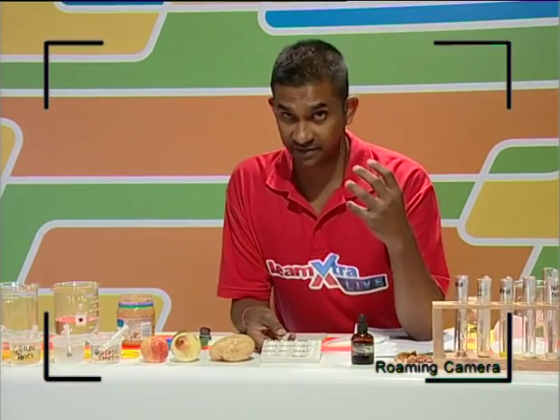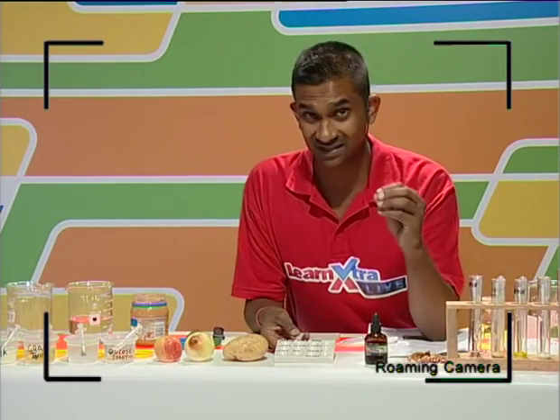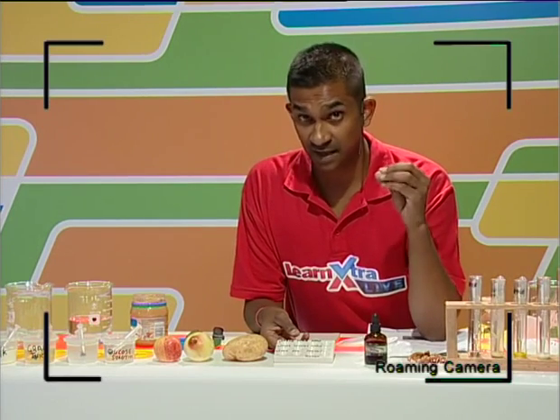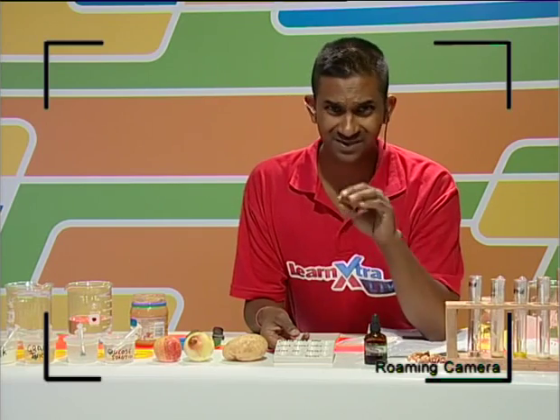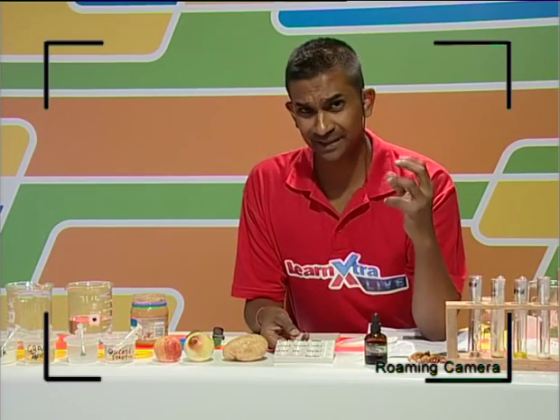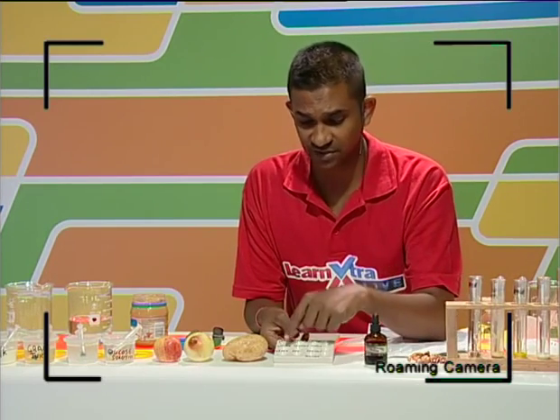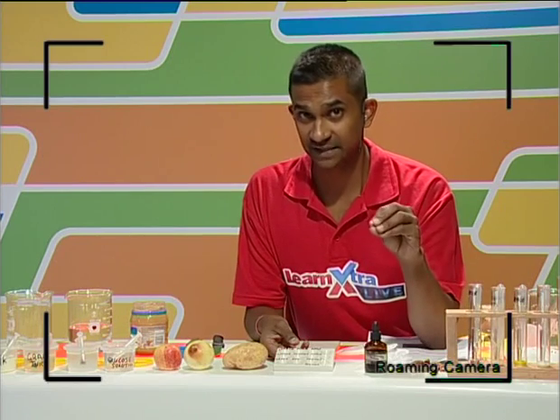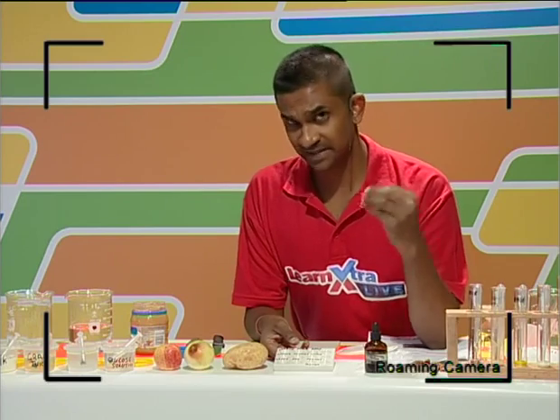If we were drinking water every day, we know that it would not contain starch, and hence we use that as a negative control. Often in a lab, we would use distilled water, which is 100% pure water and does not have any other nutrients and vitamins in it, so that would be an ideal control test tube to use. So we use water as a negative control and starch as a positive control so that we can compare other samples to them. The question is, what if we didn't have a control?